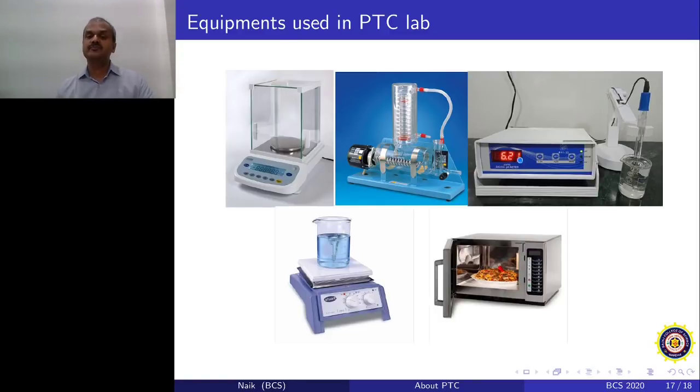So sometimes a single distillation apparatus is much better than a double distillation apparatus if you require a lot of distilled water. This is a pH meter, a tabletop pH meter. This is an electrode, and this is an electrical component where we can see the pH. You have to calibrate any pH meter, and once you calibrate the pH meter with pH tablets of 7 and 4, which are cheaply available, then only you should use the pH meter. You should not use a pH meter without calibration.